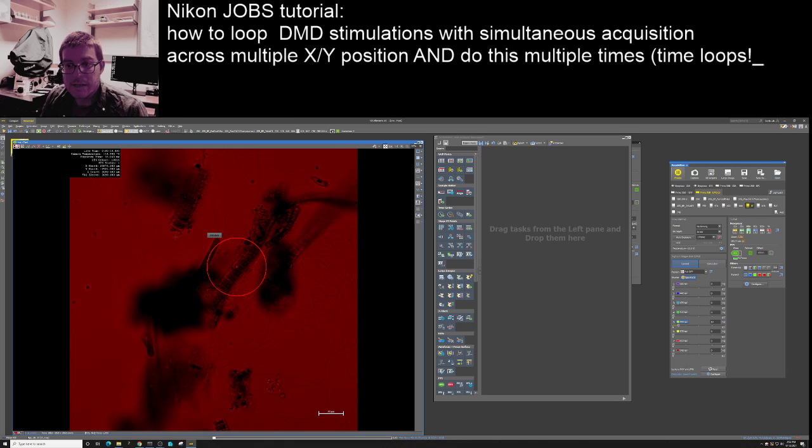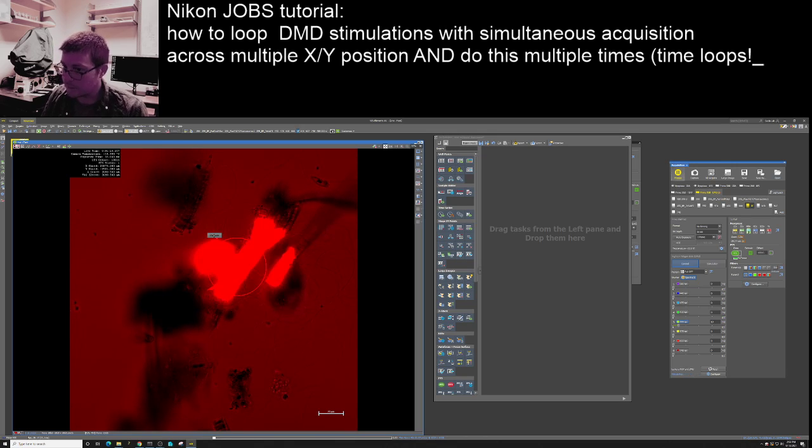So what I did here, in terms of what you're seeing, is I made an optical configuration that's bright field in the background. That is, we basically have the light on constitutively. I have called this thing BF. But it also is set up for the stimulation, so the DMD mirror is on. Basically, I duplicated one of the DMD mirror configurations and switched the bright field light on, and that's what you're looking at here. So with this optical configuration, we see everything in the sample, and then when I hit stim, we stimulate the sample. Got it?